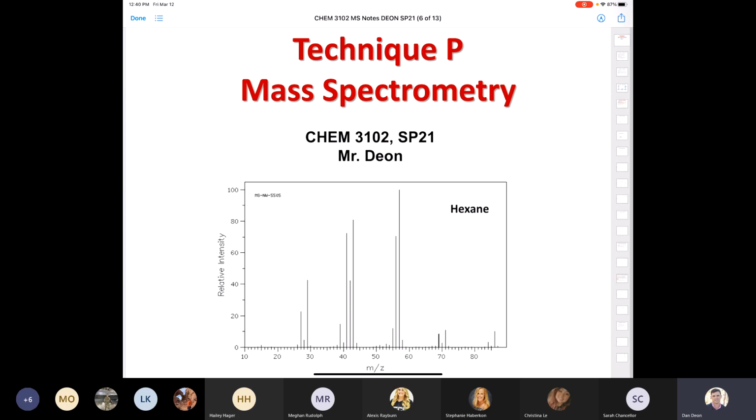If you think about the way that we look at infrared spectrometry, what I would always do is take a focused approach to each functional group and then discuss what you would see in the infrared spectrum of this functional group, or of that functional group. Well, if you look at the lecture course textbook, the 3101 textbook, the only functional groups that really get that treatment are ketones and aldehydes with respect to the McLafferty rearrangement, amines and alcohols with respect to alpha cleavage, and alcohols with respect to loss of water.